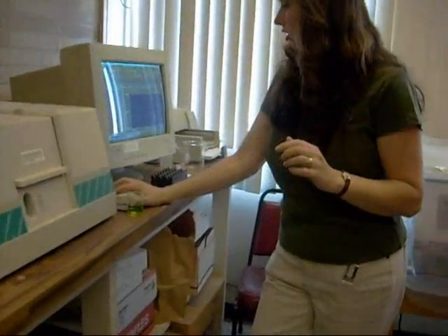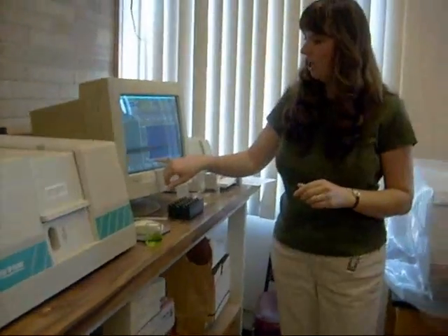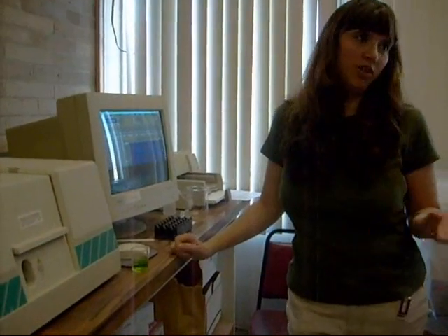separated. And so what it's doing now is it's going to actually take a reading between every one of these wavelengths with the methanol. We're doing the same thing. We're telling the machine methanol doesn't absorb any light.